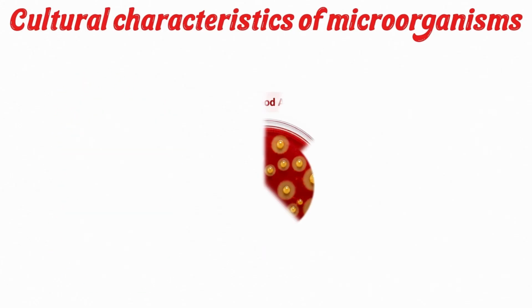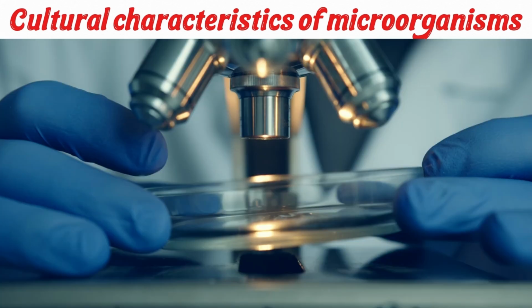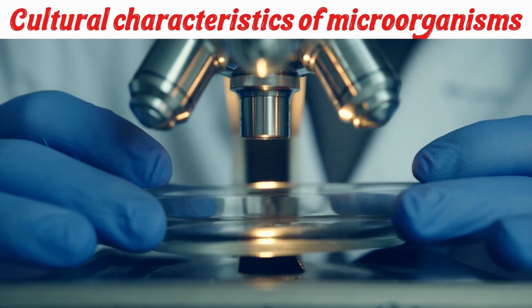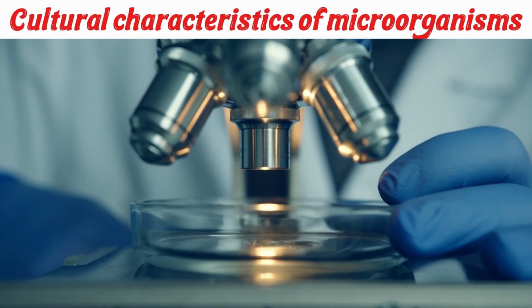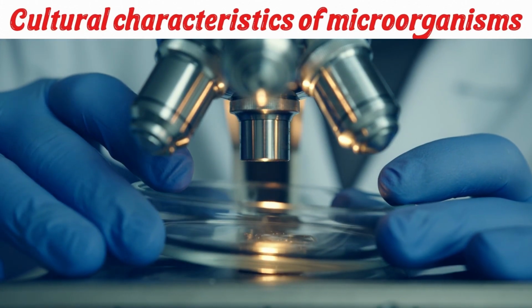When microorganisms are grown on different laboratory media, they exhibit differences in their visible appearance. These visible differences are called cultural characteristics, and microbiologists use them as one of the first clues for identifying unknown microorganisms. Although cultural characteristics alone cannot confirm the identity of a microorganism, they significantly narrow down the possibilities before biochemical or molecular tests are performed.